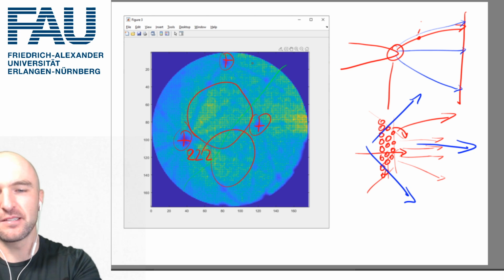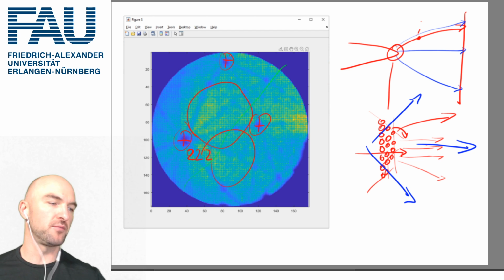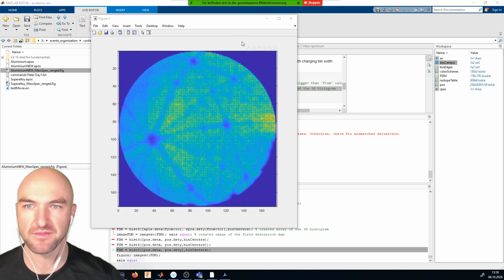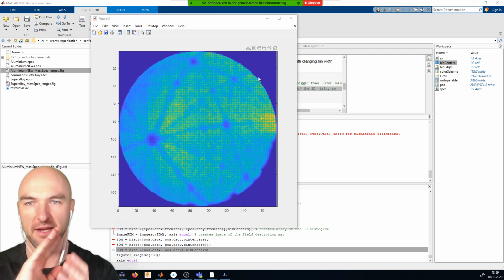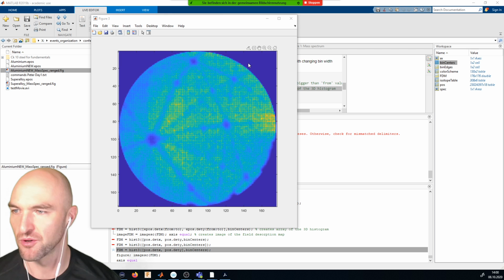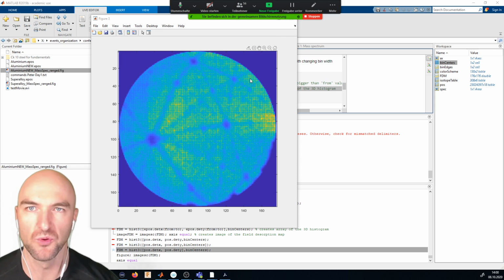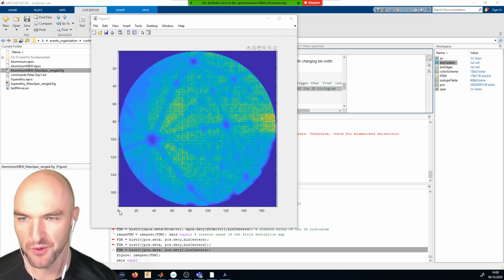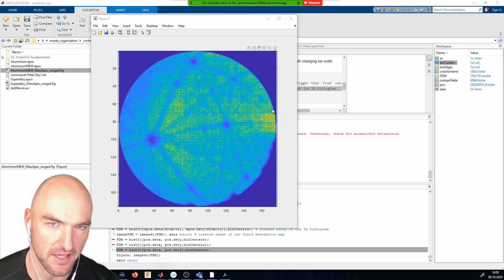And this is essentially the basis. These detector hits and the distortions are essentially the basis of the atom probe reconstruction. And you can use it to figure out which crystallographic orientation your sample has, or if there's two grains, possibly what the tilt is between the grains, and so on. And this is something we can very simply do with our binning system, to just produce a field desorption map like this. Of course, right now we don't have a scale here. This is just in pixels.